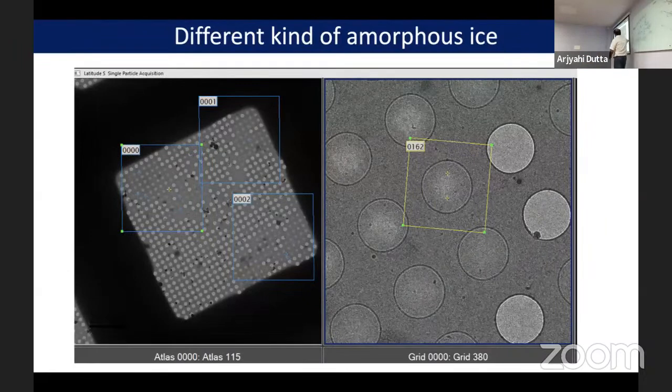Okay, now here you have something you are asking: what should be the spot? So when we are imaging something, we want a diameter that should not expose this entire area. Our sensor, this K2 camera or CCD camera, whatever we are targeting, as I mentioned, whenever you want to focus, you want to focus on the outside, not inside here, because if you start focusing there, it will melt the ice. So our spot, whatever we are targeting, is only this much area, not bigger than this one. Okay, so we can adjust what the beam diameter should be.